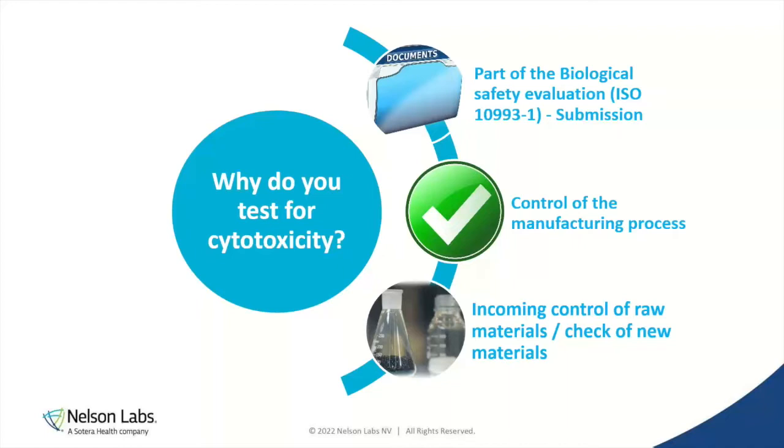Whether the cytotox test is the best test to select for this, we can discuss, but that's out of the scope of today. And of course, it's also used as an incoming control to check new materials and components that you always use. So it's often used, and because it's so widely used, you also have some failures.